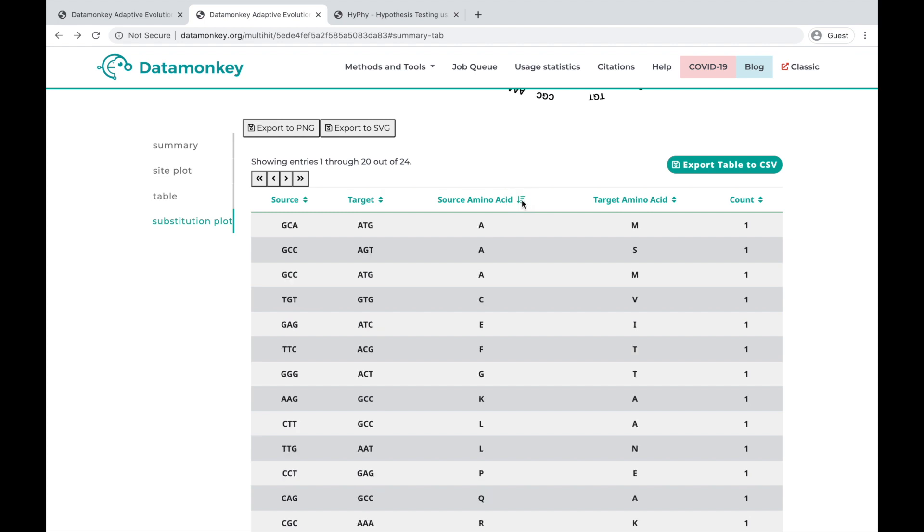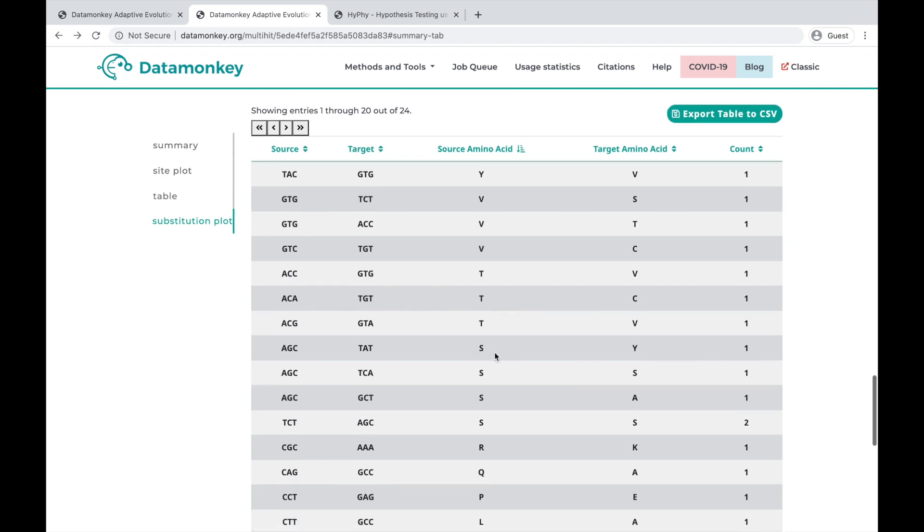For example, we can sort by the source amino acid, and we can see these are all of the codons that have a source amino acid of serine, and what they change to, and how many times they change.